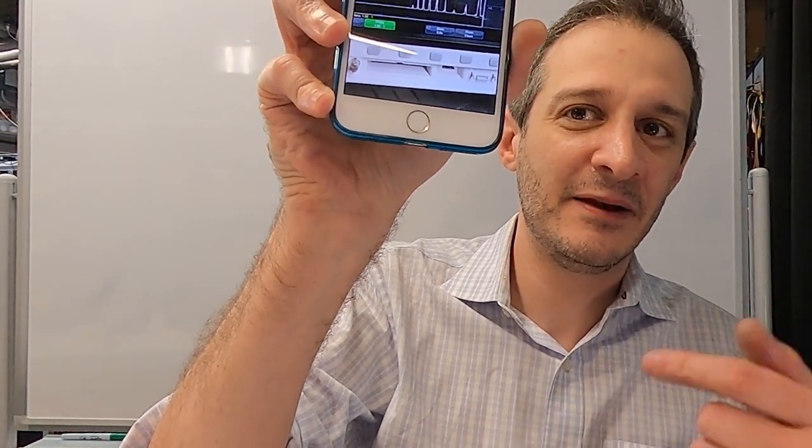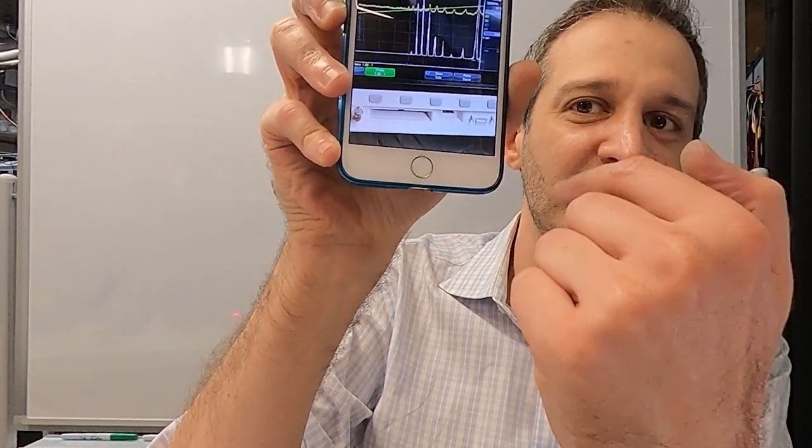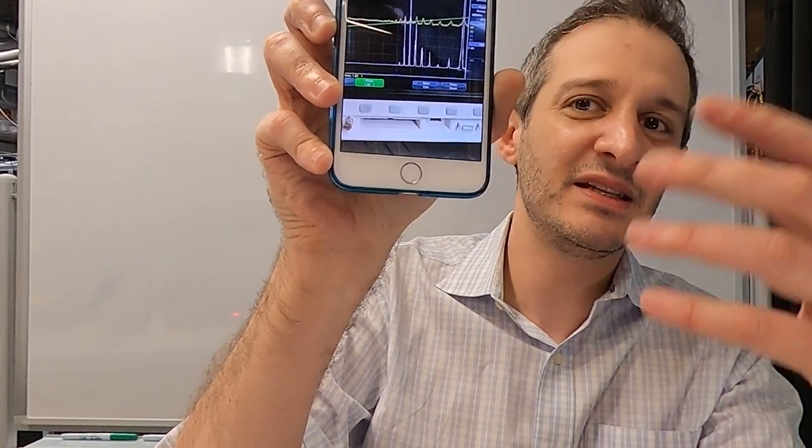Okay, so the output right on the screen. On the screen. So this is the molecular mass, and this is the intensity. Seeing those sharp peaks, it's like, oh, I'm able to separate my ions. When you saw that particular image, was that the one that made you know that you finally got it to work? I would never forget that feeling. It's like you've been trying to climb Mount Everest, and you're tired, but you were able to get to the apex, and that's really joyful.